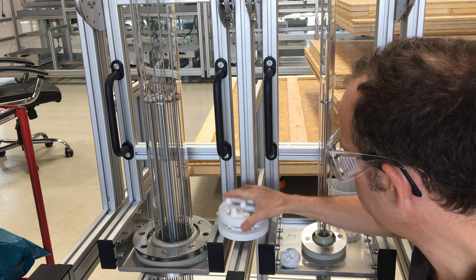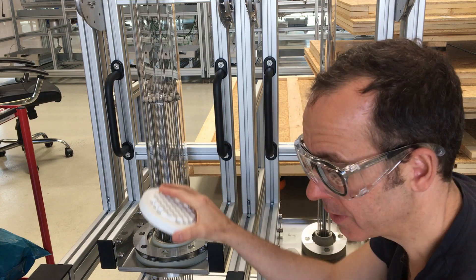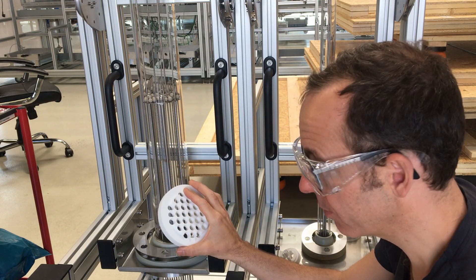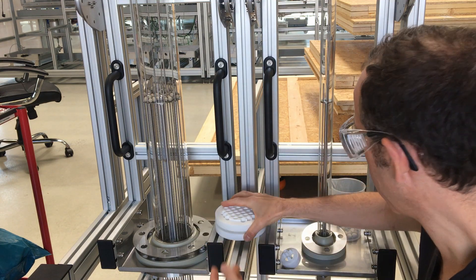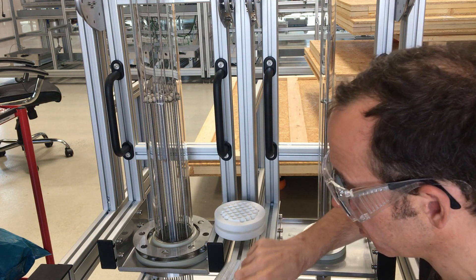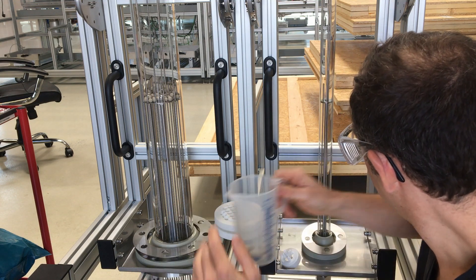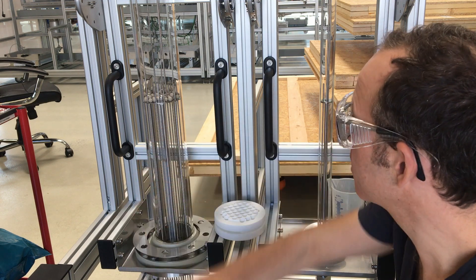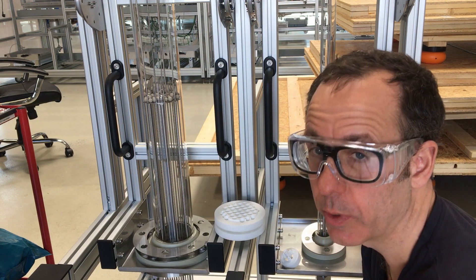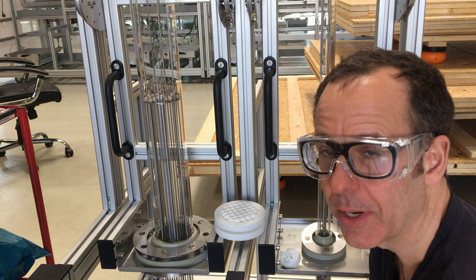We also made a number of holders which are placed in the top here. These are used for centering the thermocouples when put in, and of course the holes have to be big enough so that you can get the catalyst particles through. In many cases we're working with fairly large particles, which you can see here — this is an aluminum support. The 4 inch reactor gives you a lot of flexibility because it's much more representative of what you really have in an industrially sized unit, whereas the 1 inch is more typical of what you have at the lab scale.